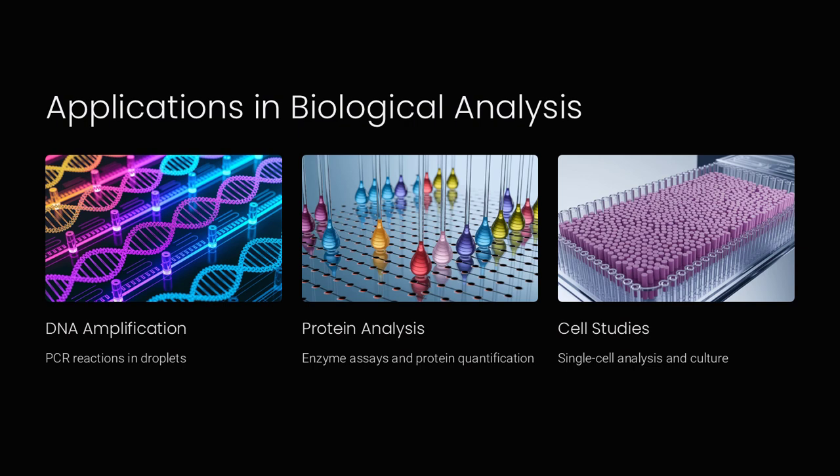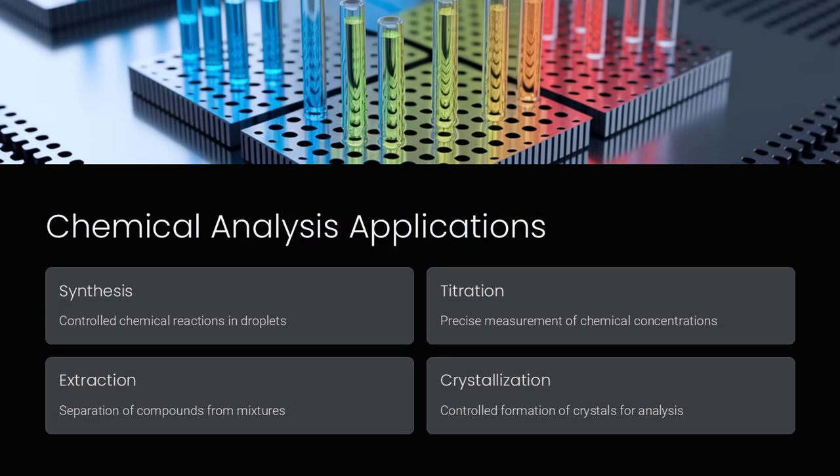A clinical laboratory uses a digital microfluidic device to automatically process patient samples, performing steps from sample preparation to analysis, significantly reducing turnaround time. Imagine an assembly line where each station automatically performs its task with precision, resulting in a finished product without requiring constant manual oversight.